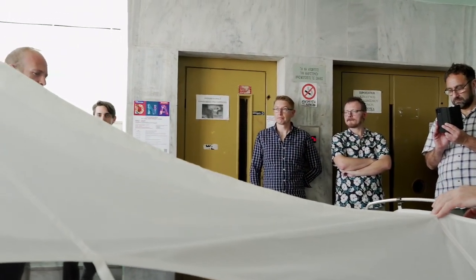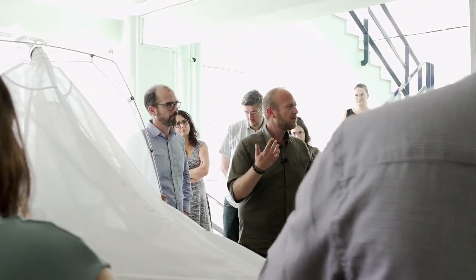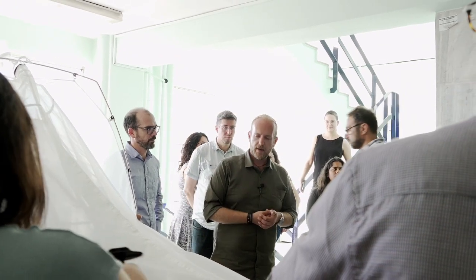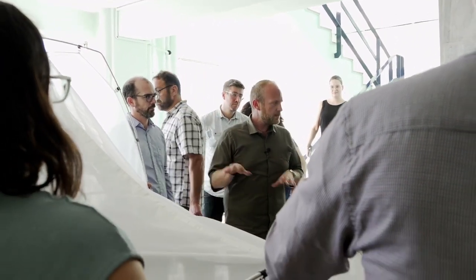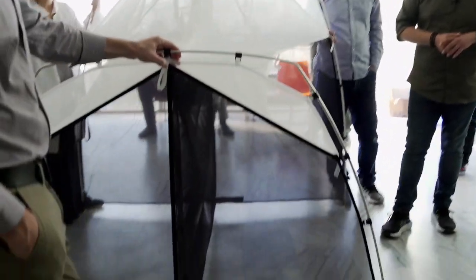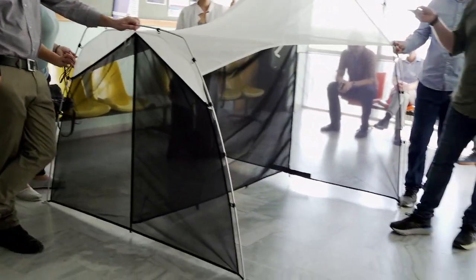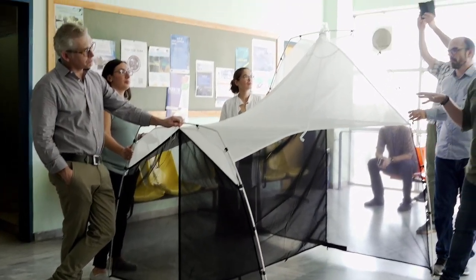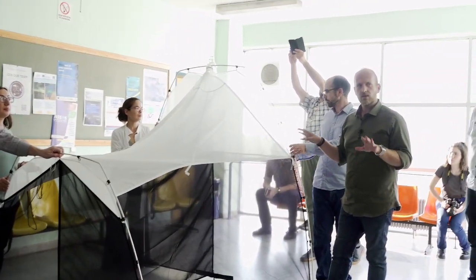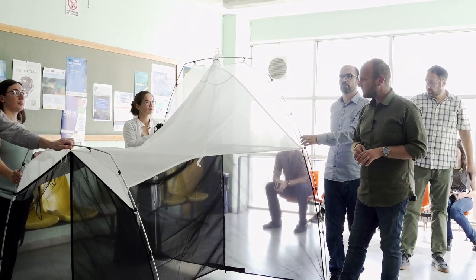Here even there were periods with strong winds, especially the periods now of autumn, because we have north winds in the area, and it was okay. But we were lucky enough also because all around the spots we placed it, there were kind of trees. So there was some protection there.